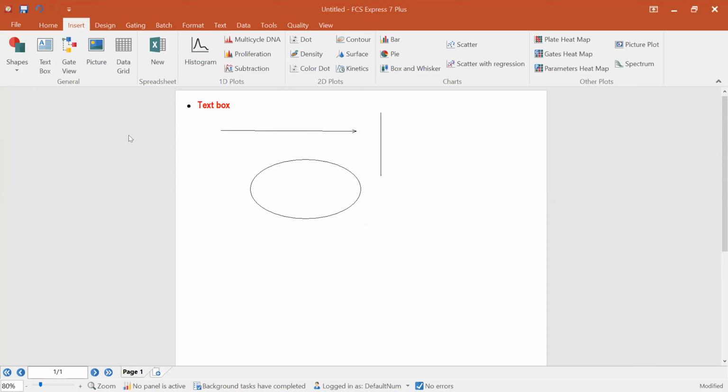It works like PowerPoint. But when it comes to working with flow data, and let me use my handy dandy undo button up here, right? So you can see that we can undo and redo just like we would do in PowerPoint. That's going to work back to 30 steps by default. If you find yourself making a lot more mistakes than 30, well, you might want to restart your analysis. But if you really wanted to, you could actually increase your undos to 100 in the options in FCS Express. But getting back here, right, we want to analyze some flow data.